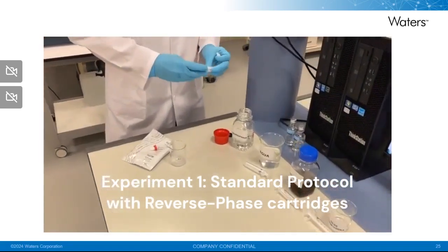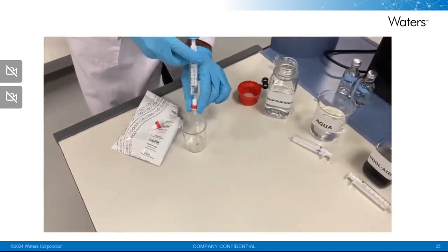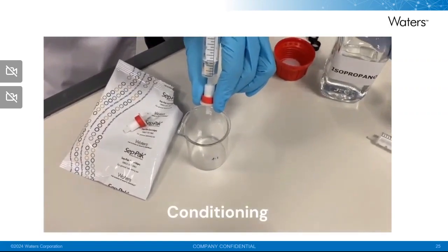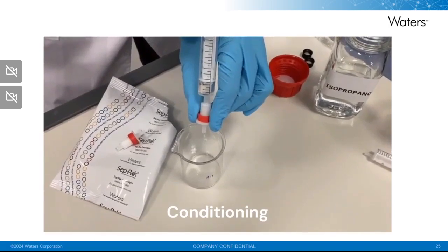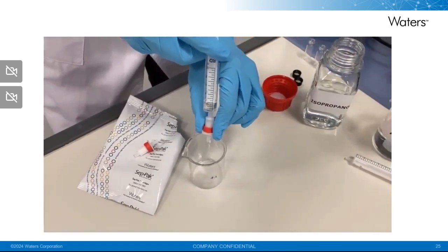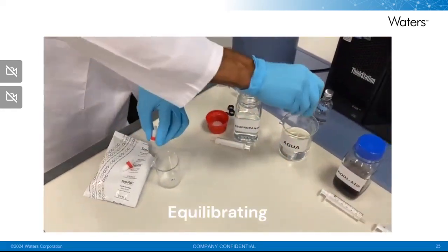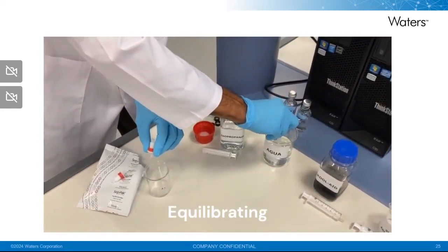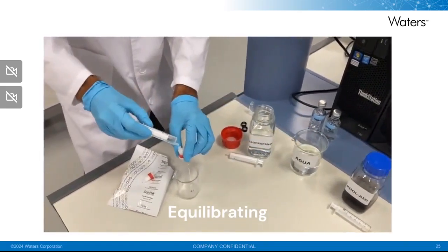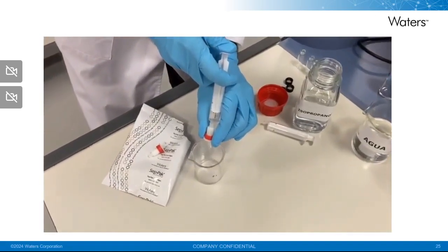The first step, the standard protocol, is to condition. And in reverse phase, we're going to be conditioning with a strong solvent. And in this case, we're going to be using isopropanol. Both in the conditioning and the equilibration steps, we don't have to take care of going very slowly. We can go relatively fast. So the second step, as I said before, is the equilibration, and we do that with water. We just pass some water through the cartridge.